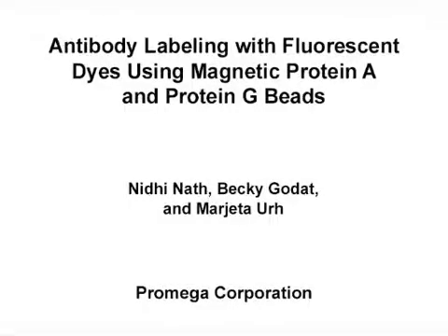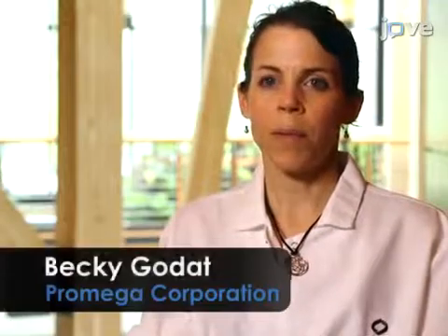The overall goal of this method is to label antibodies with fluorescent dyes from purified samples or directly from cell medium using magnetic protein A or G beads. This method can be used to optimize the labeling chemistry of even small amounts of antibodies within the cell medium, leading to better downstream application. The main advantages are that the antibodies do not require purification, amine or thiol chemistry can be used, and the method can be automated or manual.